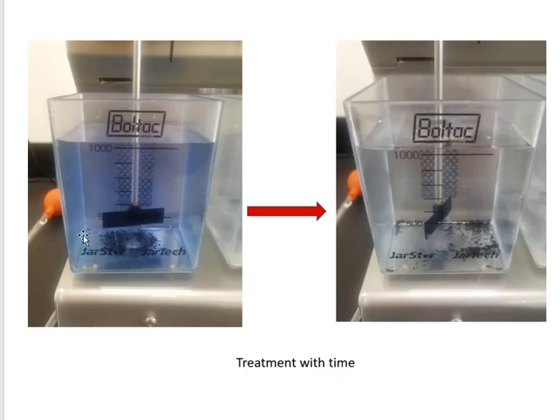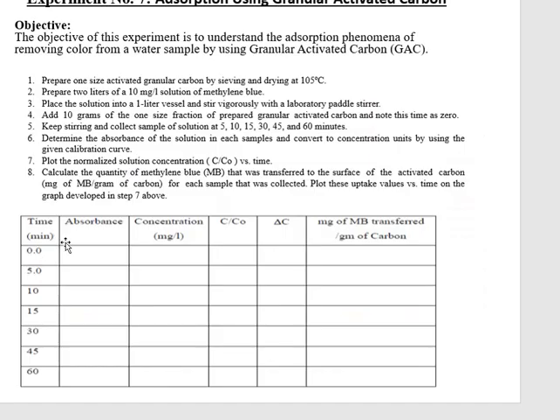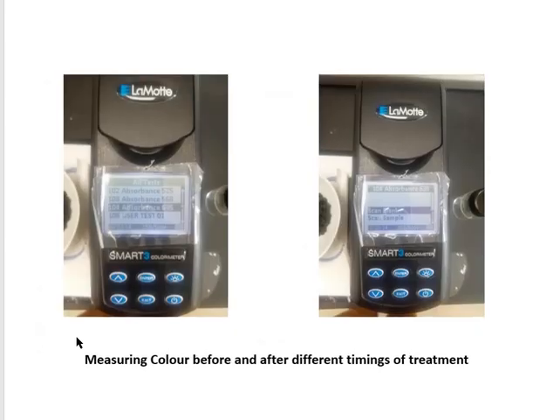After that, you will collect different samples at different time intervals, as I told you in the data: at 0 time, initially before adding the carbon, then after 5 minutes, 10, 15, and so on. Then we use a colorimeter. You remember we used the colorimeter in one of the experiments. So you have to switch it on. Then in the main menu, for all programs, you will go to the experiment number, which is testing number 104.